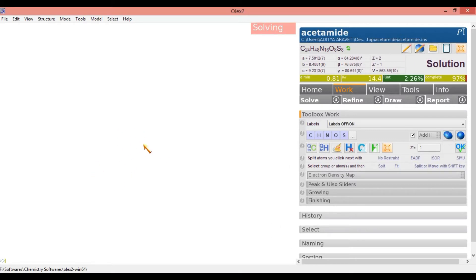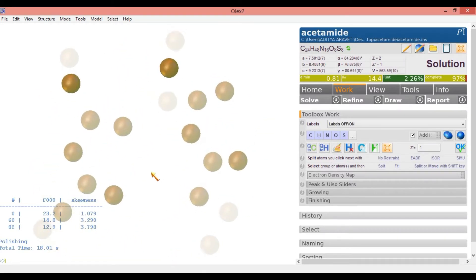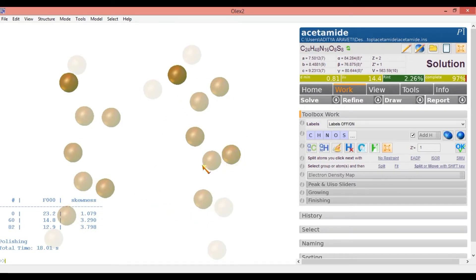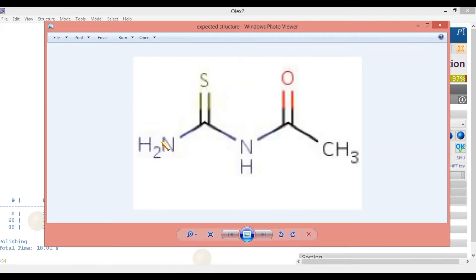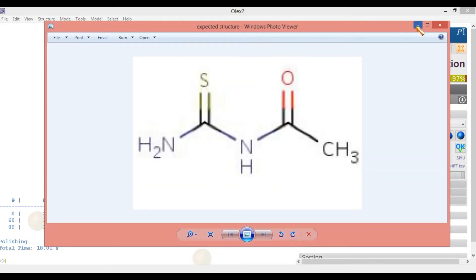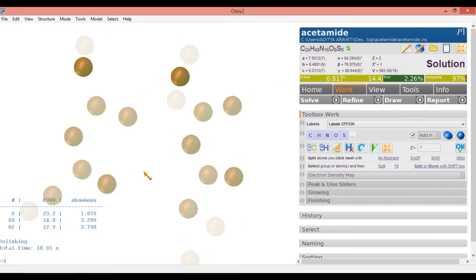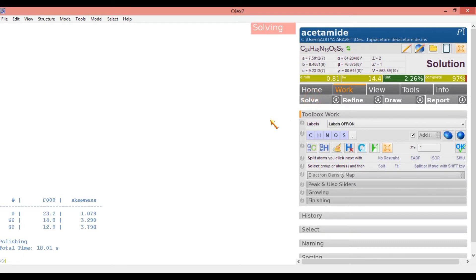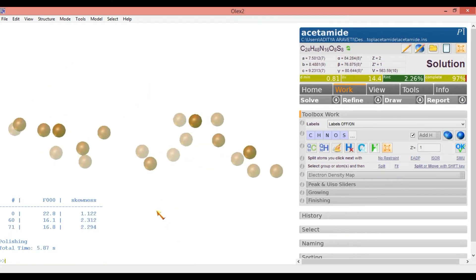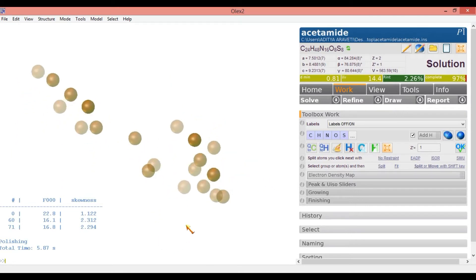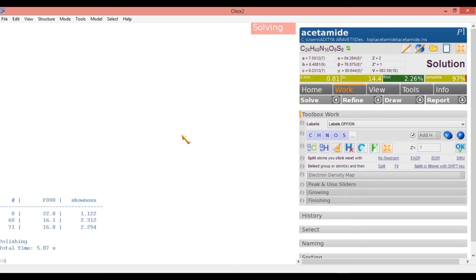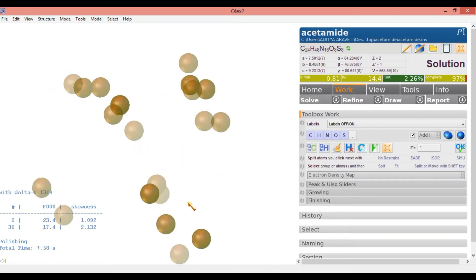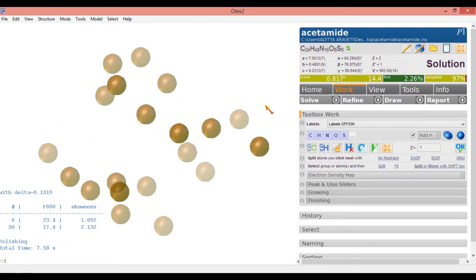Now solving is going on. Here you can see two molecules — I think two dimeric molecules I have got here. But my expected structure is a single molecule. So let me check again whether I get a singlet or a doublet. I am clicking Solve again. Here also I cannot find the exact structure, so I am clicking Solve again.